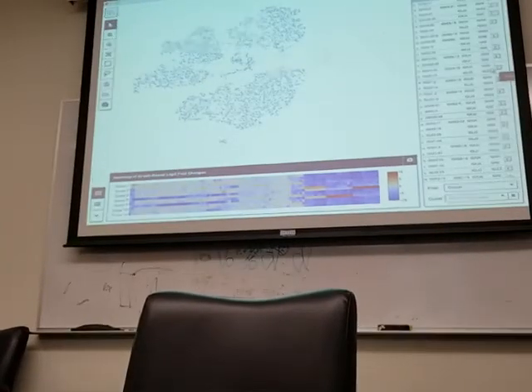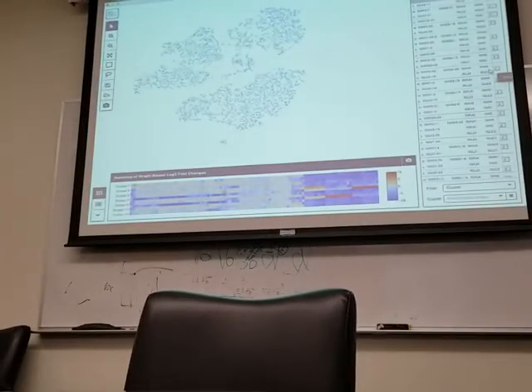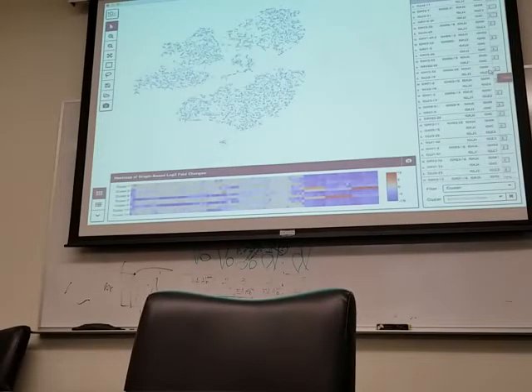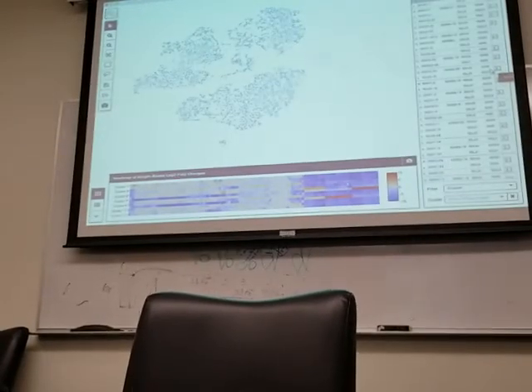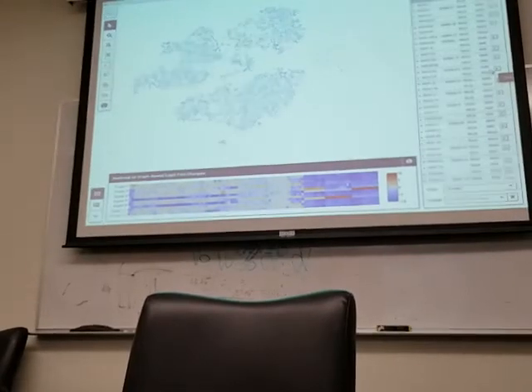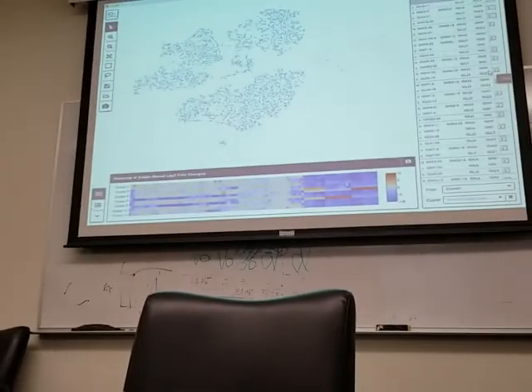Right, so it sounds like clonality is really going to be a function of the joining of the heavy and the light chains in the particular V and J genes. But why do you say that? Because if you have 2 sequences that might have the same V heavy and V light, but different J's, they're going to be different. What if J doesn't matter too much? What if it's a low affinity antigen? So you're not really asking about clonotypes. You're asking about things that might be reactive to the same thing. Yes, exactly, I see what you're saying.